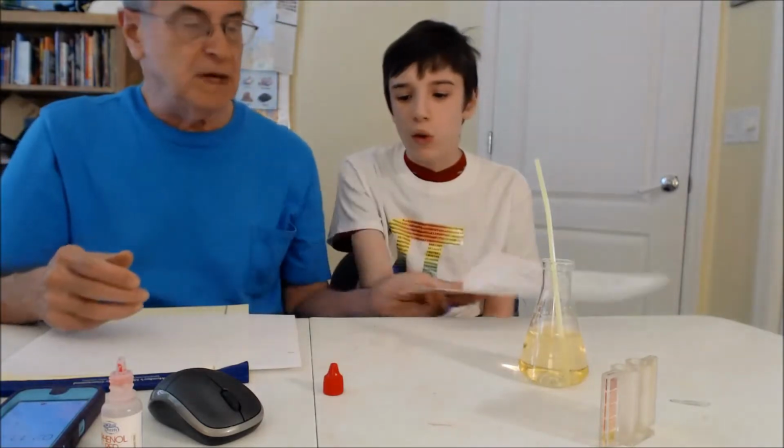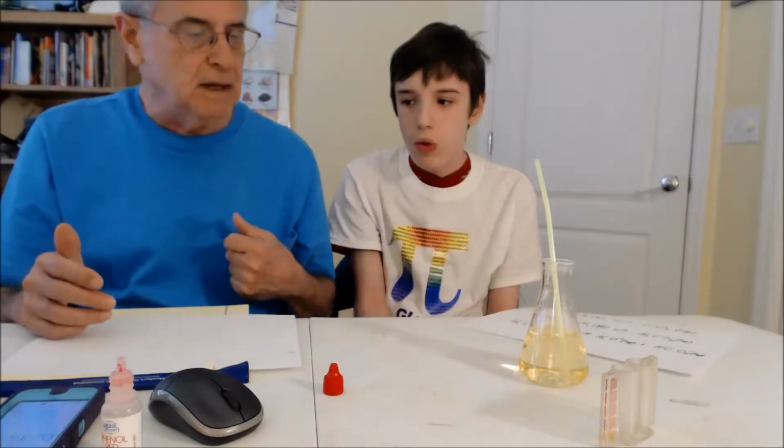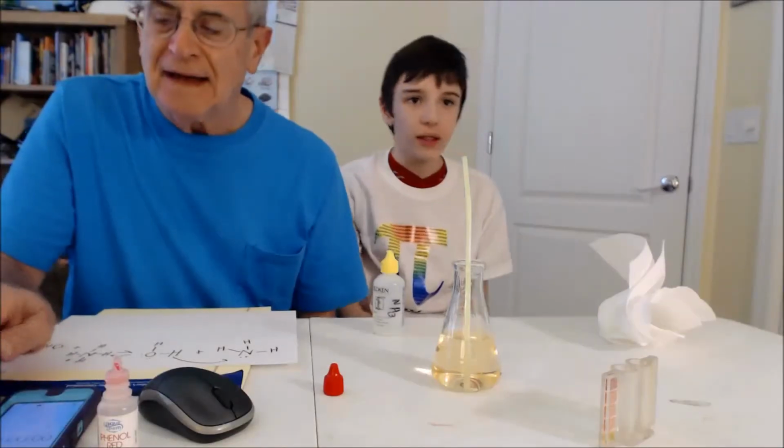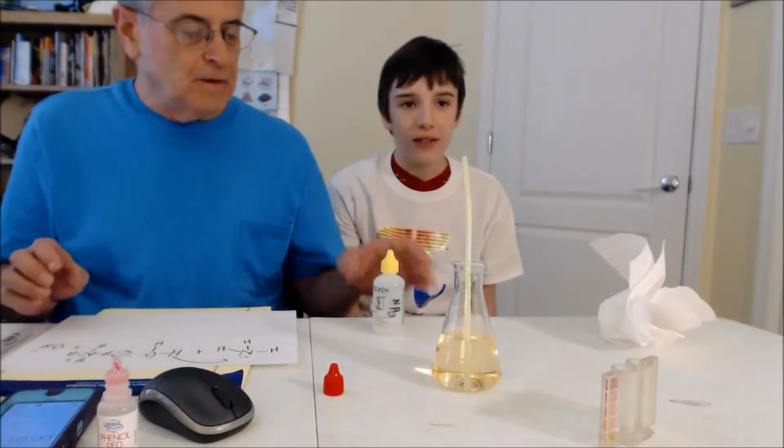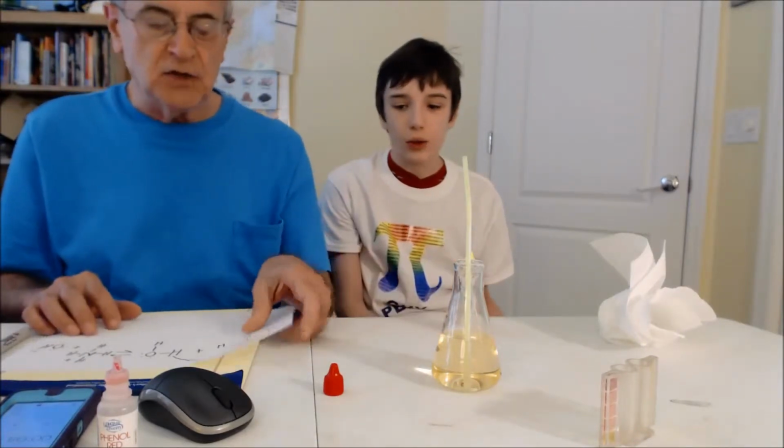Now, if we added some base to this, it would go back to being pink. We've got a little ammonia here. We wanted to get a little base. Now, ammonia is NH3.